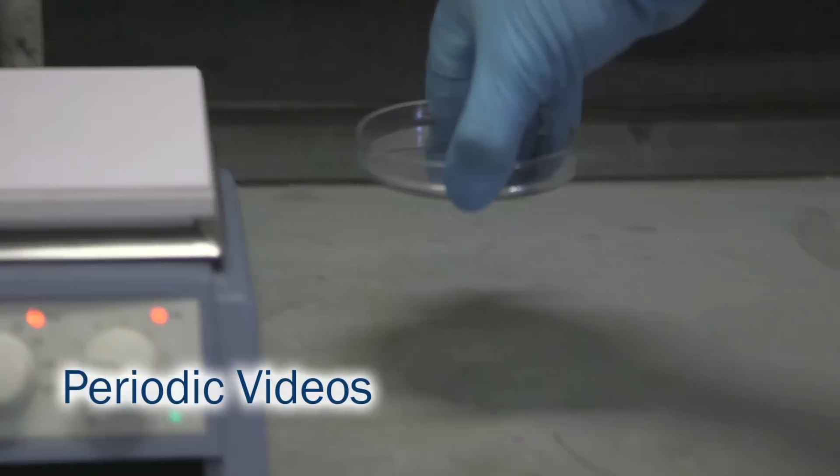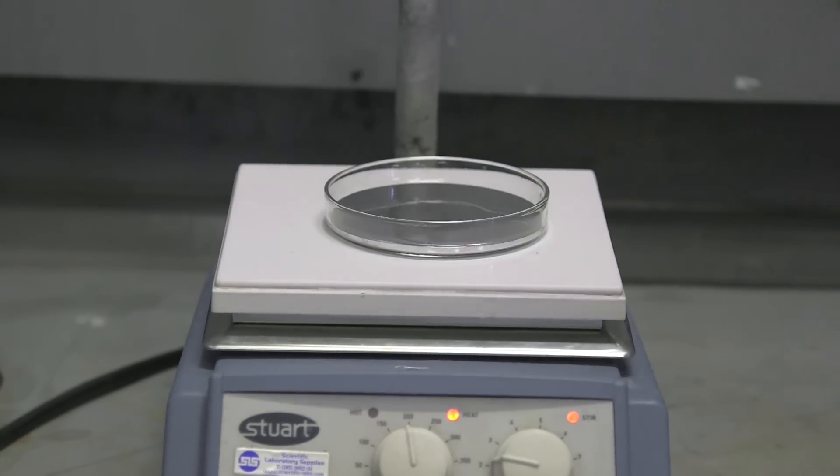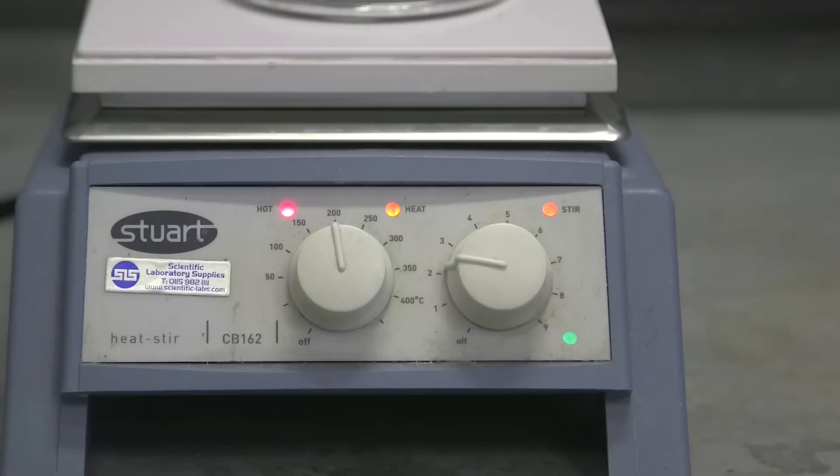Mercury is a fascinating material — even I enjoy playing with it — but like most heavy metals it is poisonous. It's quite surprising to people: if you have this liquid running around in a dish, how can it possibly poison you if you're not touching it? The answer is that there is vapor of mercury coming off which you can breathe, and remarkably it's quite easy to show you how this vapor comes off.